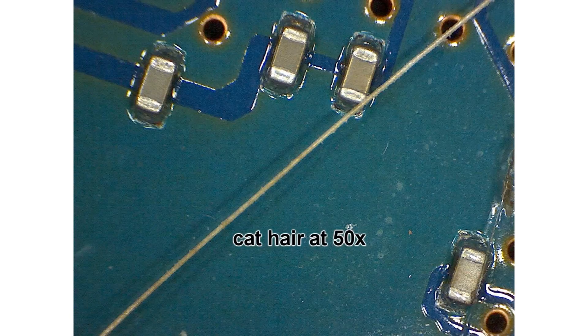Now despite all of that, I still think it's a good product, because the bottom line is it has amazing magnification and it takes very sharp detailed pictures. And that's what I care about the most, and it does it at a low cost.